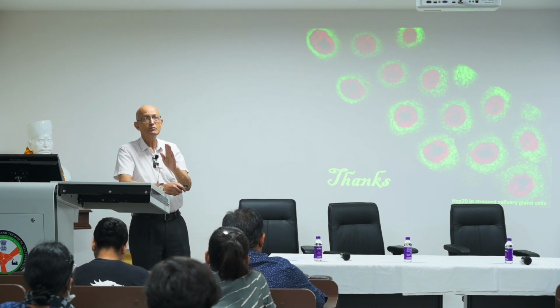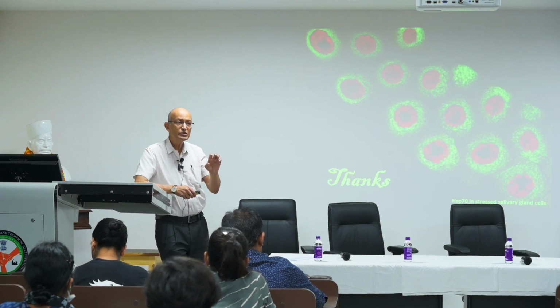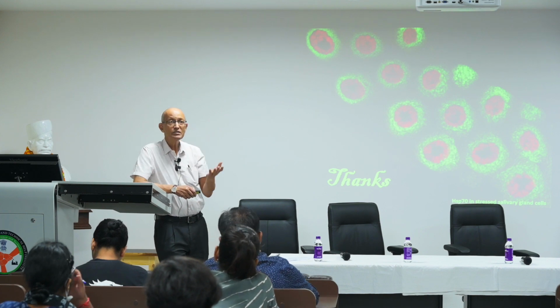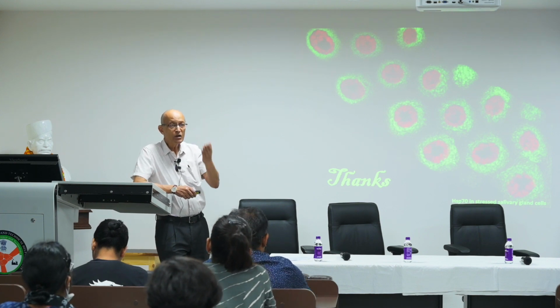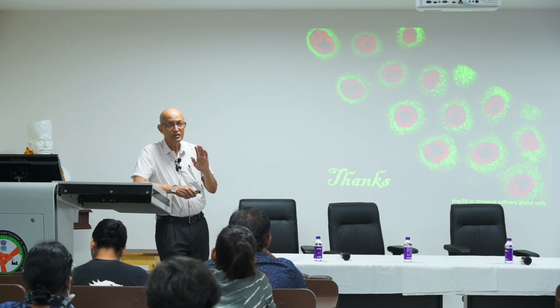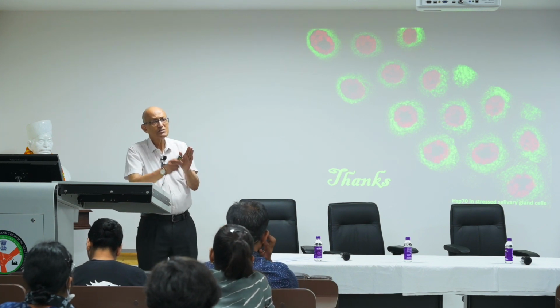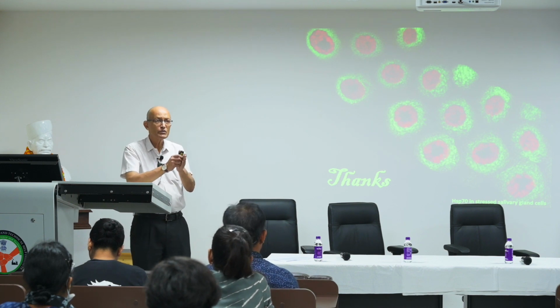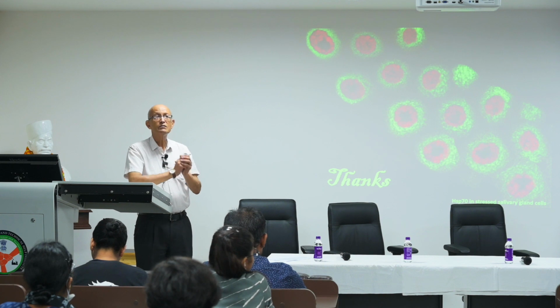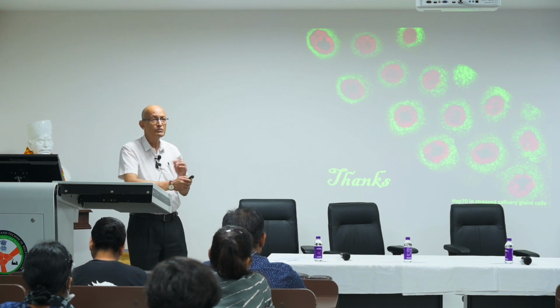And that's one advantage of multiphoton, that you are exposing tissue to lesser energy because you are using a higher wavelength, and the photodamage is less. But then one problem that can happen is that because of infrared it can get heated, and prolonged exposure can quench fluorescence at other levels as well. So there are trade-offs. What you can do with multiphoton, certain things are better than in standard confocal and vice versa.